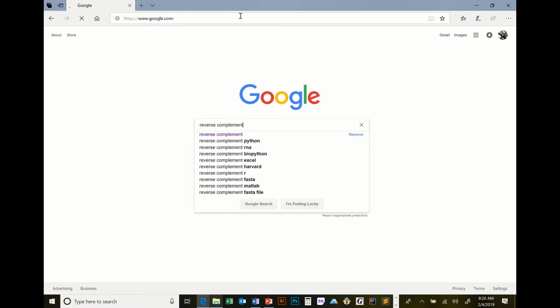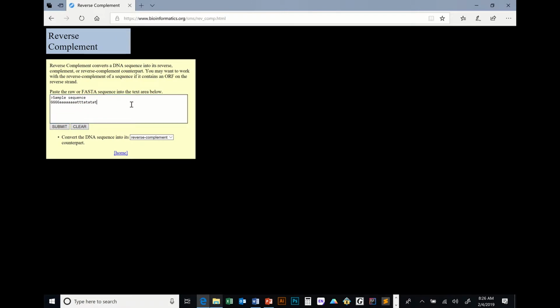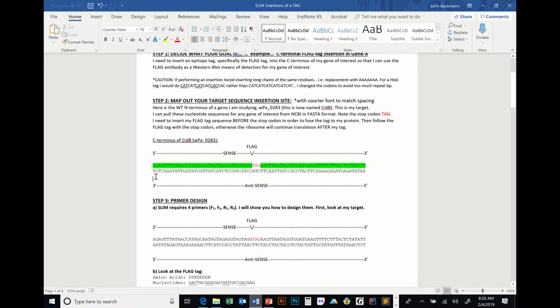Reverse complement. So you're saying all I need to do is reverse that sequence. So I can change this to reverse. And then let's test this. Good catch. Fix that.